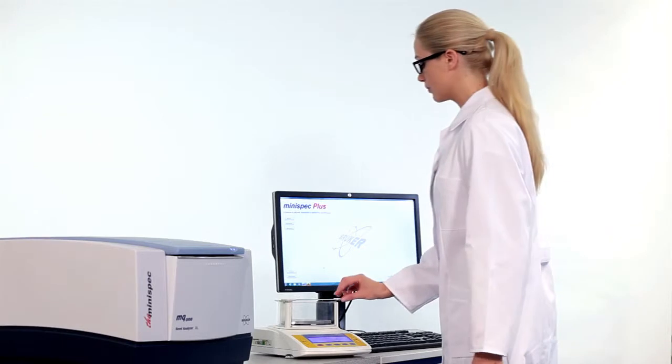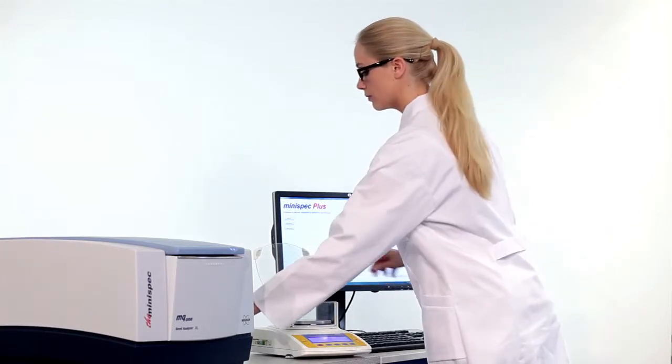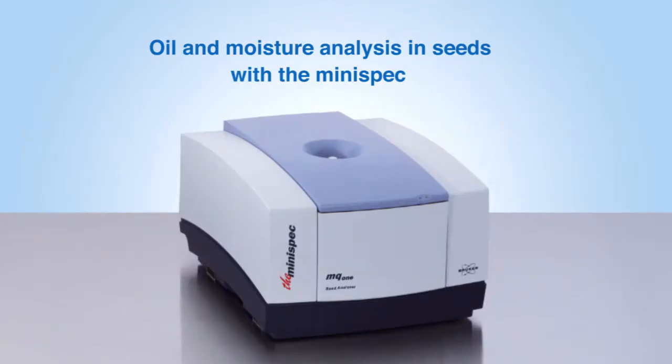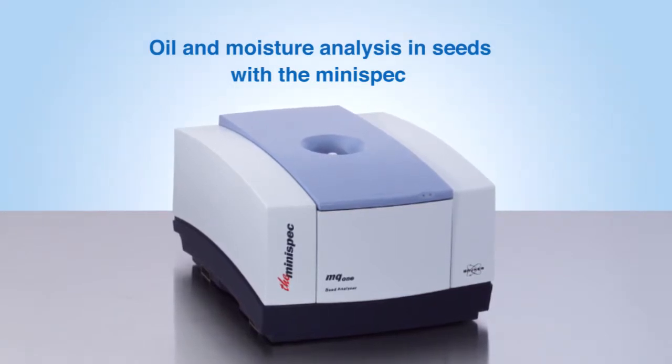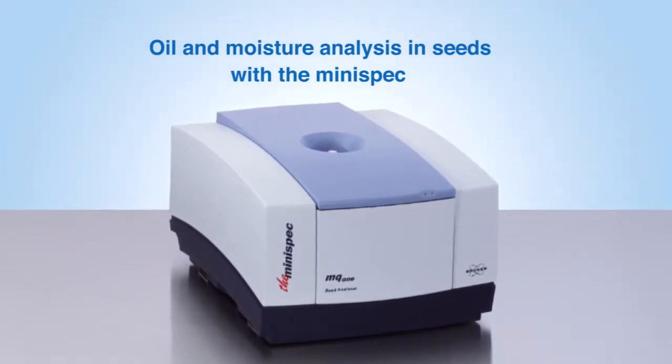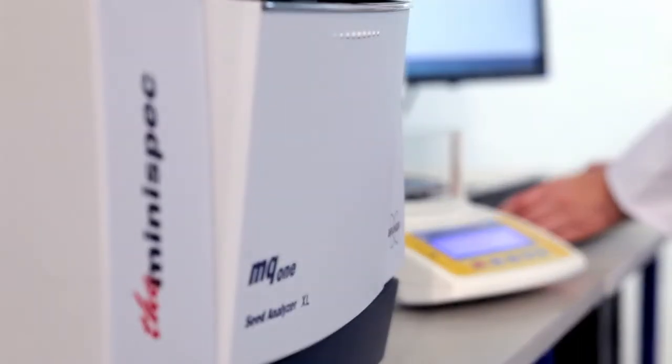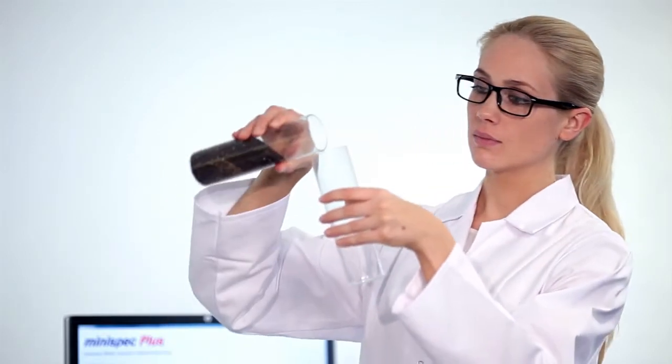Oil and moisture analysis in seeds with time domain nuclear magnetic resonance using the minispec seed analyzer. The price of seeds depends on their oil content; moisture content influences the shelf life. Therefore, oil mills and analytical laboratories analyze large amounts of samples every day, especially during harvest.